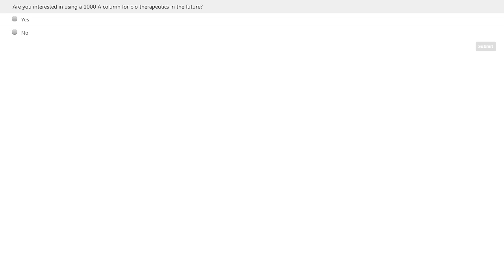Okay. Well, you'd certainly have a lot less problem with a purified monoclonal antibody than, say, a dirty production sample right off the line or right out of the kettle.